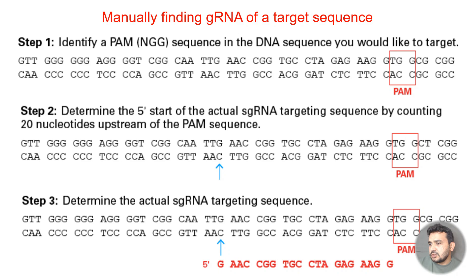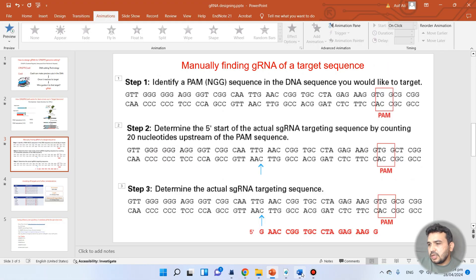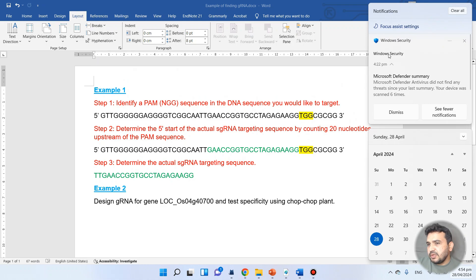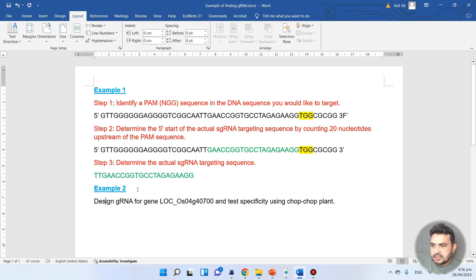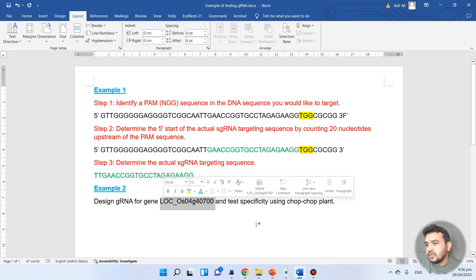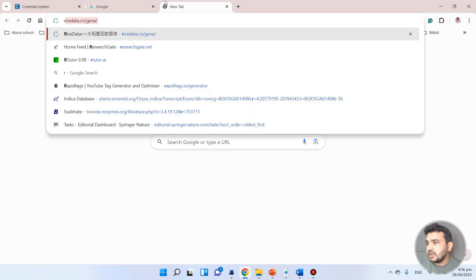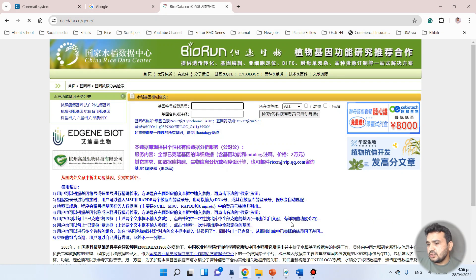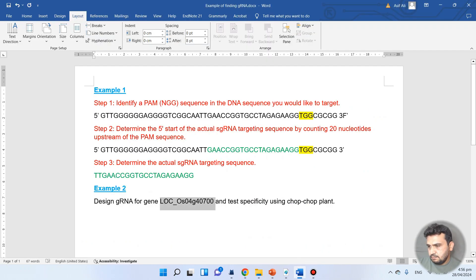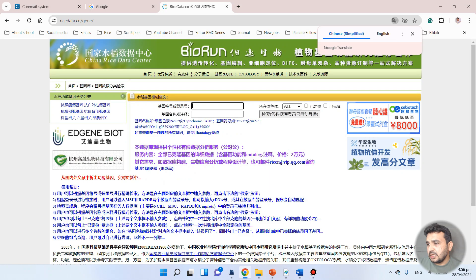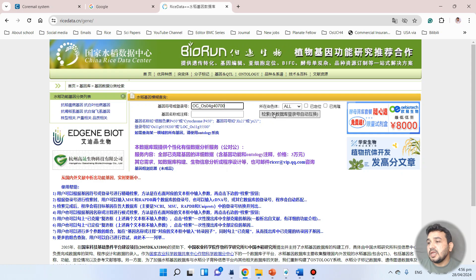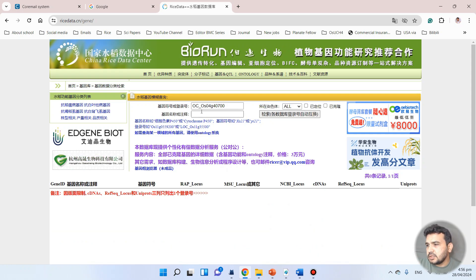I will show you one example of how we can design guide RNA from different databases. This is the same simple example I showed in the slides. This gene belongs to rice, so let me take you to the rice database — rice data dot cn — and show you how we can design guide RNA for this gene. We can copy and paste the gene ID directly.